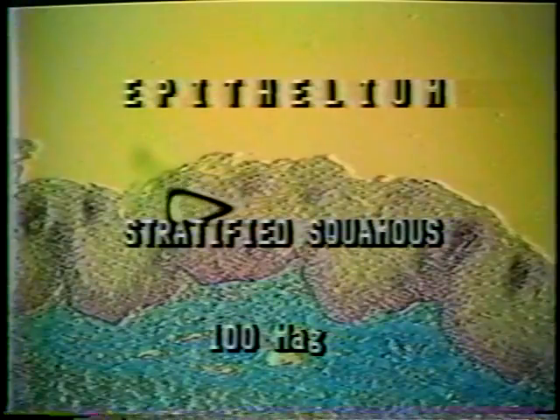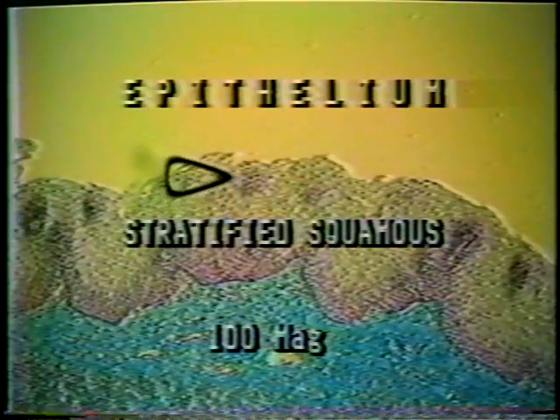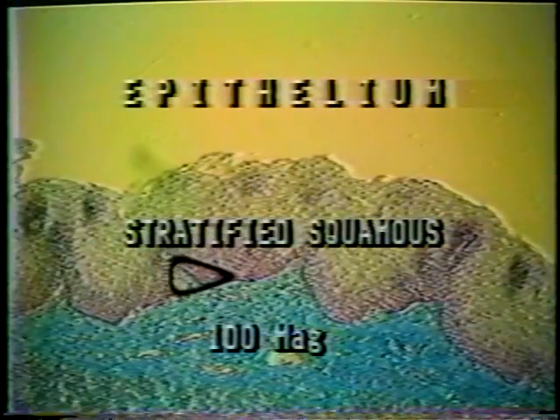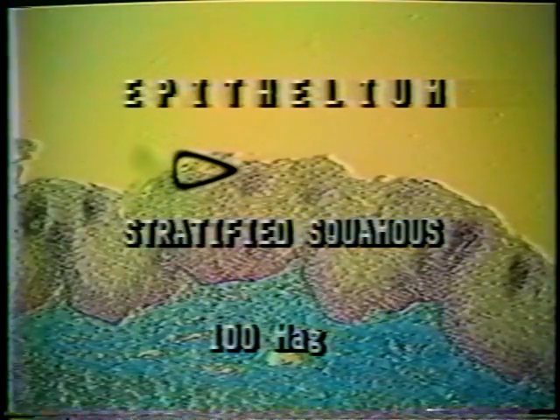All covering and lining epithelia are attached to deeper tissue at a basement membrane. The opposite edge is free at the surface or the cavity space. You cannot see each cell, but you can see the many dark spots which are the nuclei of individual cells. The example you are viewing is of the esophagus. It is similar to other locations where stratified squamous epithelia are found.